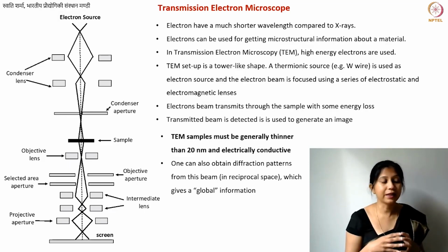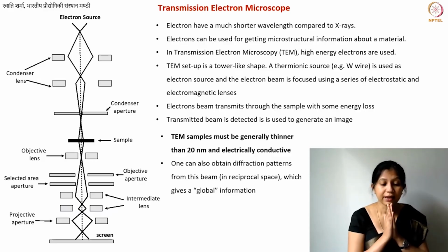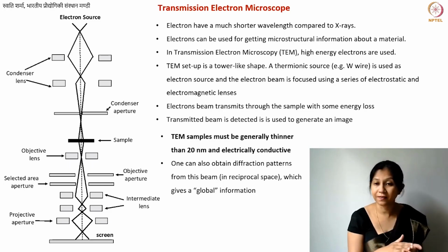Okay, and that is why it becomes a little bit tricky when you're using, let's say, bulk carbon materials. If I want to take the transmission electron micrograph of a glass-like carbon material, and I purchase glass-like carbon in bulk, in that case what I will need to do is make either a powder or a slice which is thinner than 20 nanometer. You cannot use just some kind of milling or ball milling to make that kind of sample, because 20 nanometer, believe me, is very, very small. So you will have to maybe prepare a slice using what is known as focused ion beam milling.